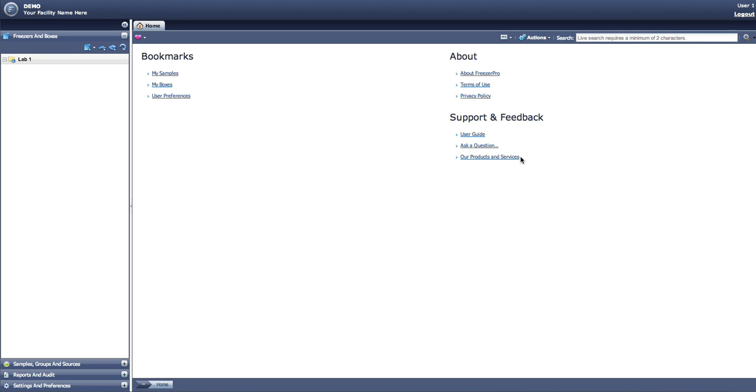There are a few other tools to use in the general user interface. The Heart button represents your Favorites section. When viewing a box, you may decide to add it to your favorites. By selecting this tool, you may view any of your favorite boxes and select it from the list in order to jump straight to it. This is a very useful tool if you are often working in a few select boxes.